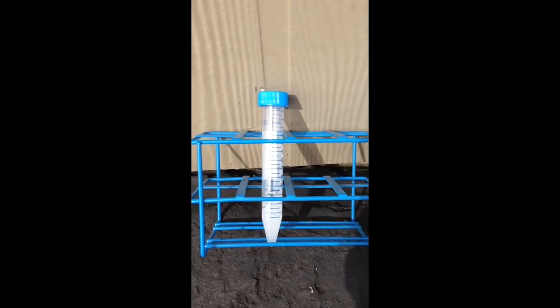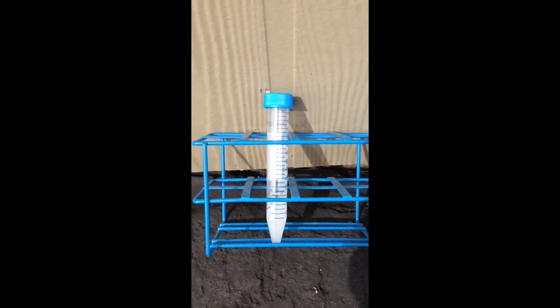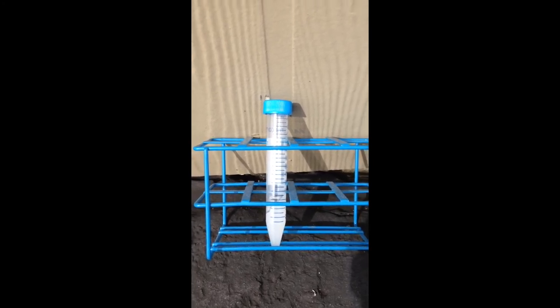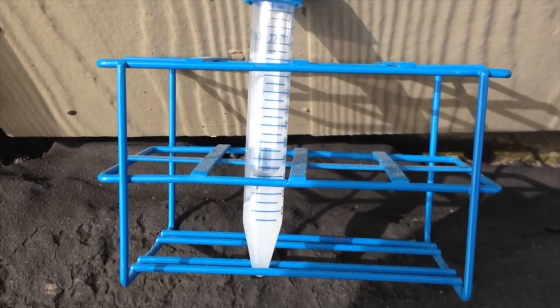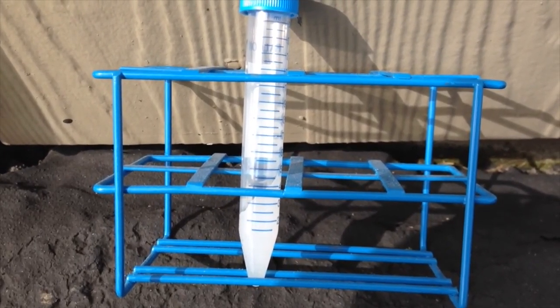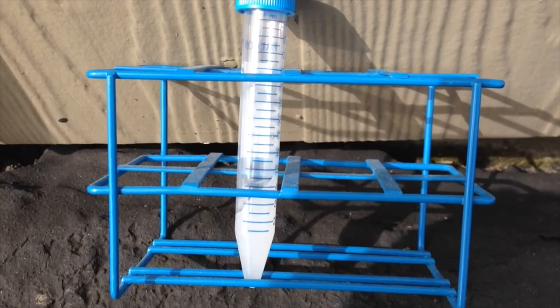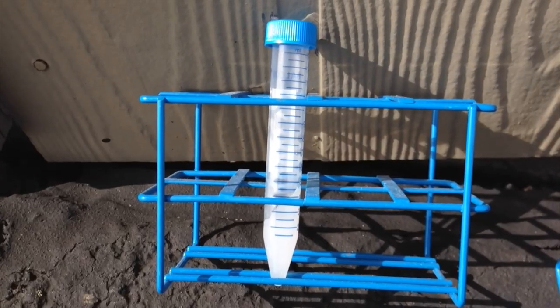As you can see, there is no discoloration of the gel after 4 hours of direct sunlight exposure. This experiment demonstrates MTR-550's chemical ability to withstand extended direct sunlight exposure without discoloration.